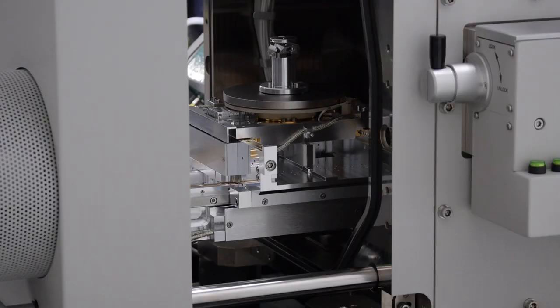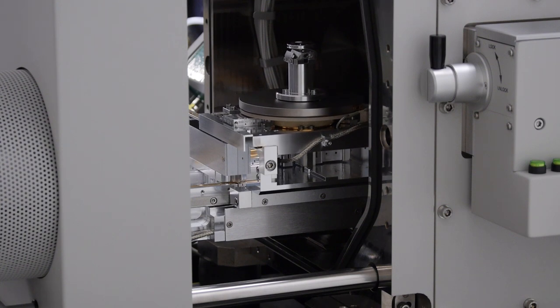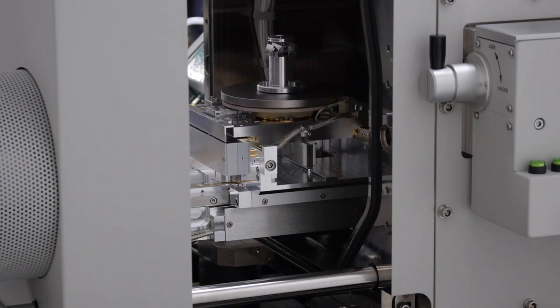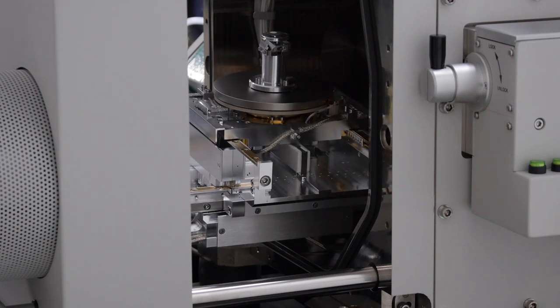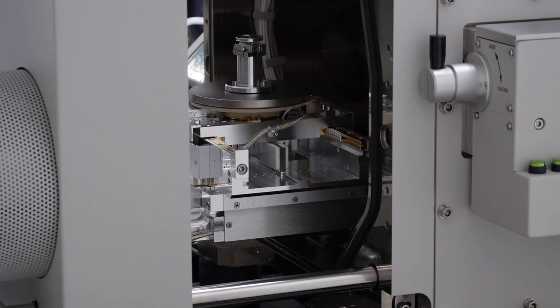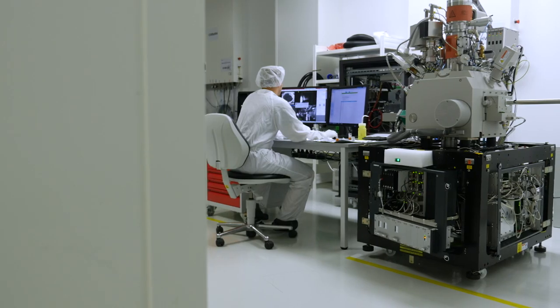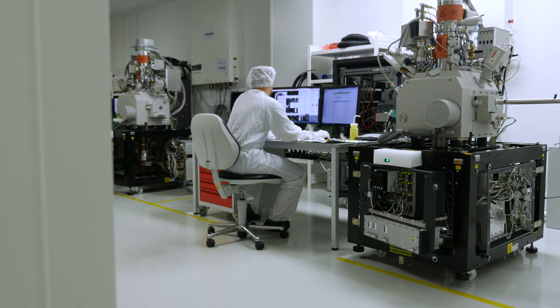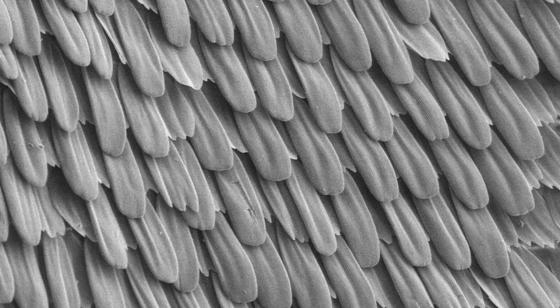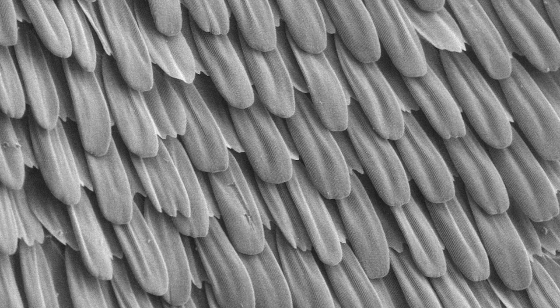The image quality in the scanning microscope depends on the orientation and distance of the sample from detectors and the final lens. The stage on which the sample is placed makes it possible to move it vertically along the X and Y axes, up and down in the direction of the Z axis, and with a possible inclination and rotation. These movements are performed with step motors and are controlled by the computer.